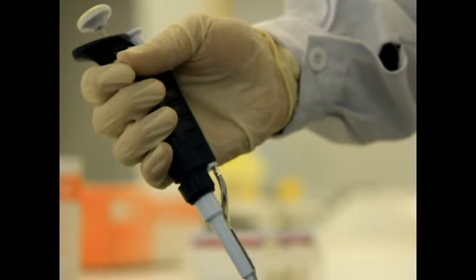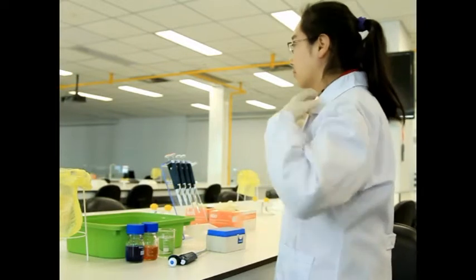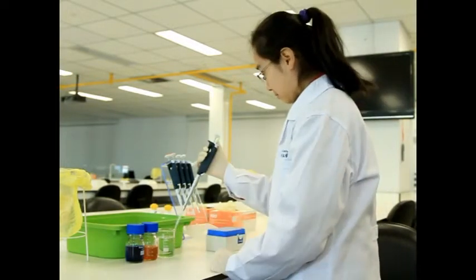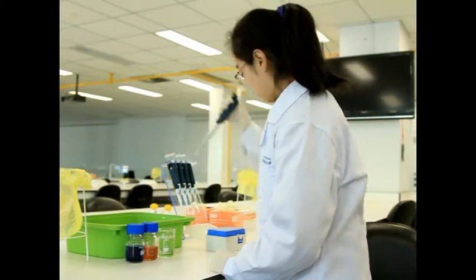To achieve the greatest accuracy, it is best to select the smaller pipette that can handle the volume you wish to transfer. You should always wear a lab coat and use gloves. If the pipette tip touches any surface or another sample, then change the tip to a clean one.